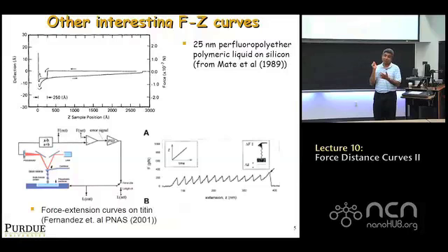So you go to the situation. So there are two surfaces happening here, really. One is the surface between the liquid and the silicon, which behaves more like the infinitely stiff surface with attractive forces that I showed you, that it snaps in and pulls away. And then there's a second interface, which is the liquid-air interface, where it behaves more like the meniscus example that I showed you before. So you put the whole thing together and it becomes obvious what's happening. But it's pretty cool. You can start really understanding the physics of what's going on in this very nicely.